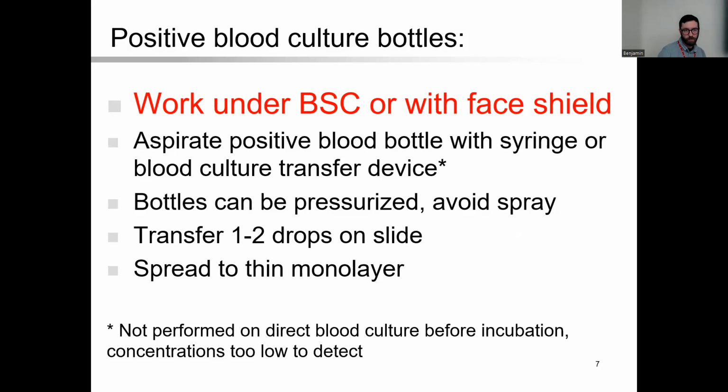And then most blood culture systems use the buildup of CO2 inside the bottle to flag positive. So if it flags positive, it can be pressurized. So you want to be careful about that. And then you're just going to take 1 or 2 drops, put them on the slide, and use some sort of sterile stick to spread to a thin monolayer.